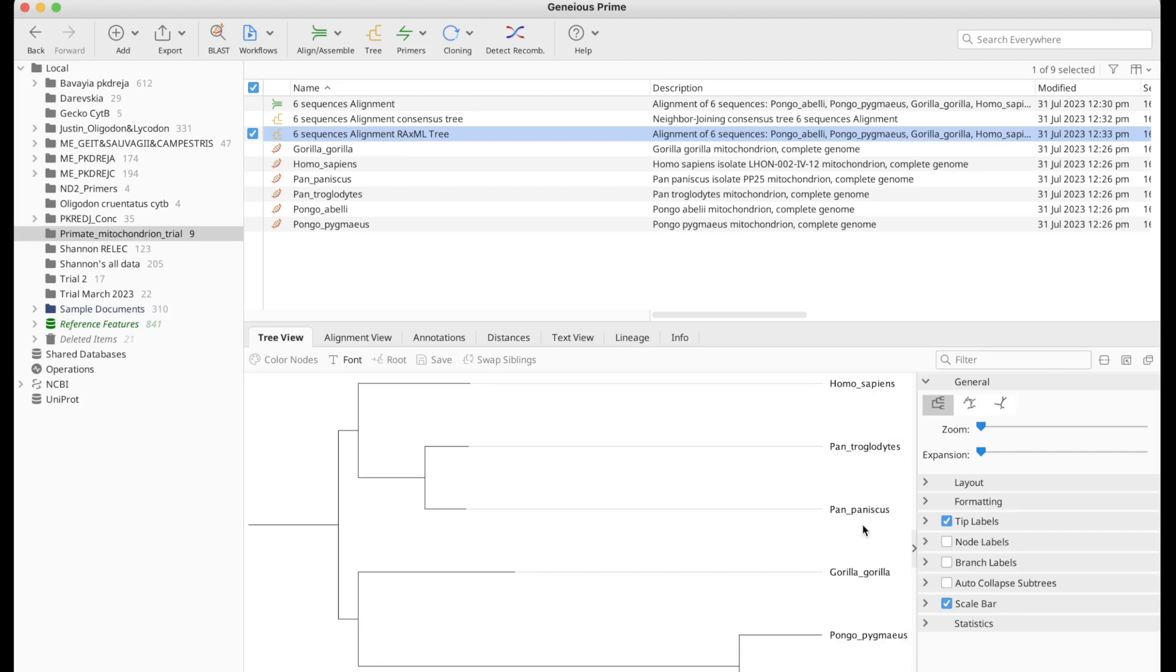The method you're going to be choosing is going to depend on your research. But most of the time, if you are getting very different trees with different algorithms, then the problem is probably in your alignments. Or you're not choosing the right settings for your tree building method. And this is how you create phylogenetic trees on Genius Prime.